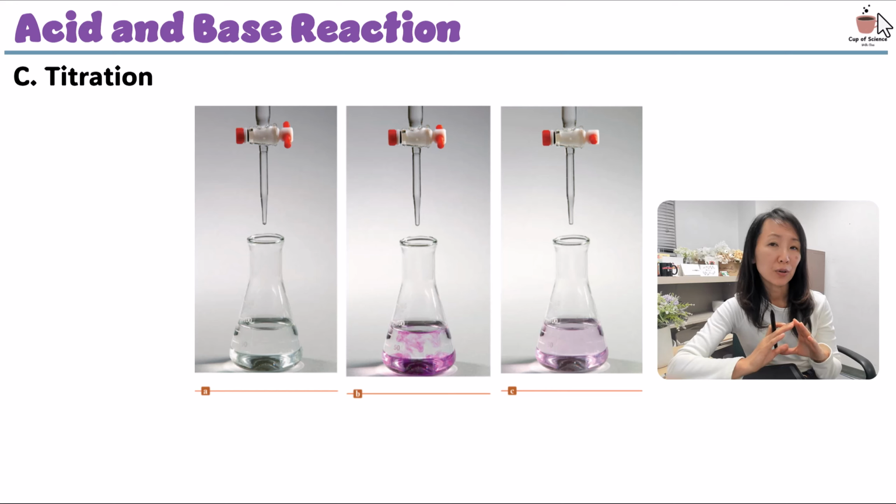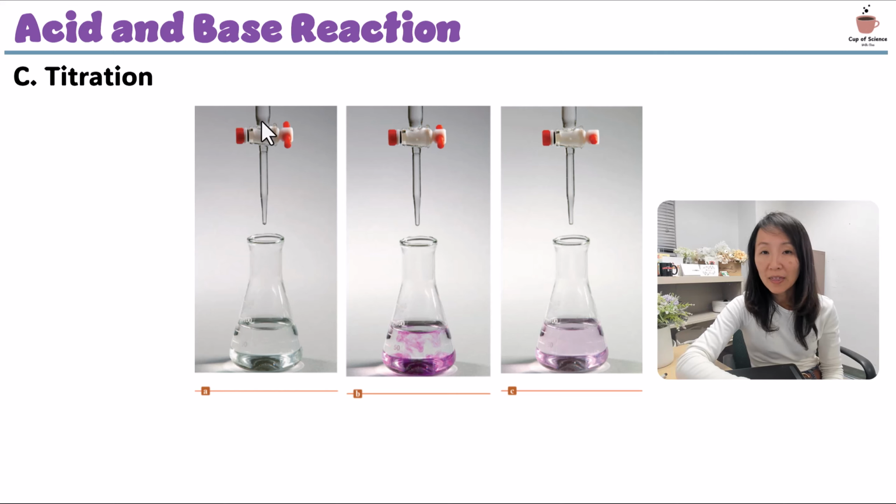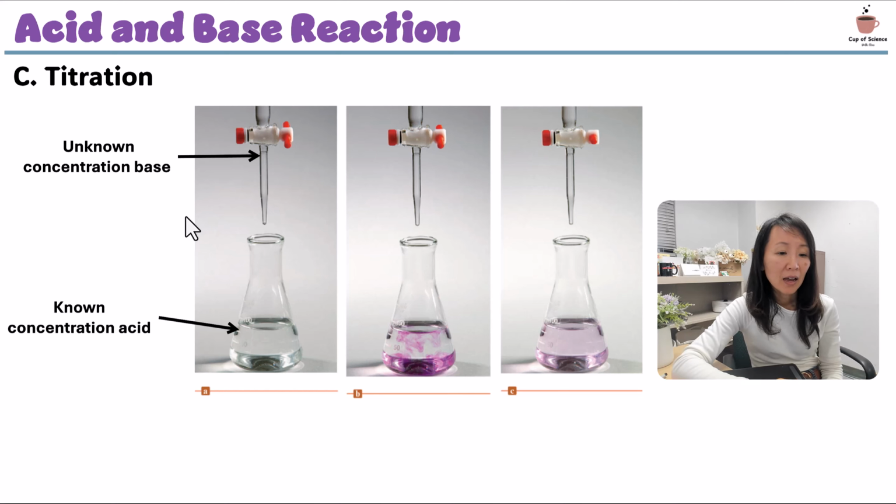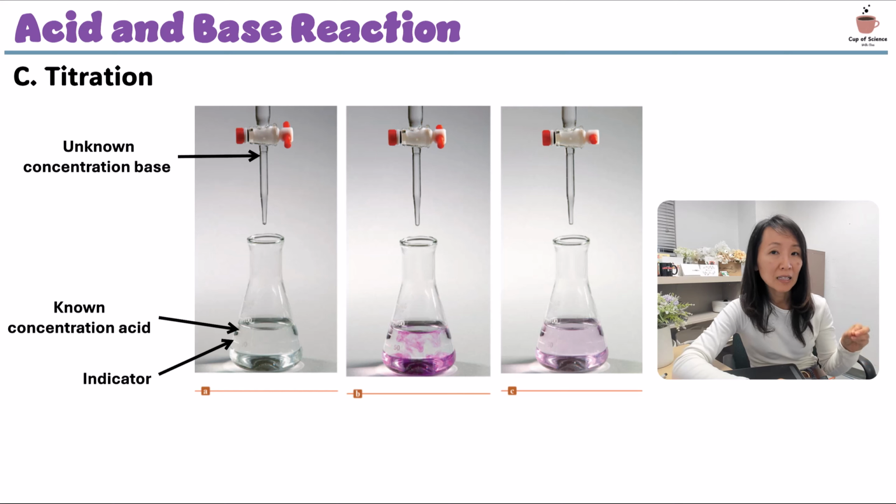This image shows an overview of an experiment called titration. This over here on top is the burette, and in that burette is a base of unknown concentration, meaning I don't know the base molarity in there. In here is an acid, but we know the concentration of the acid. And also in that same solution is an indicator.